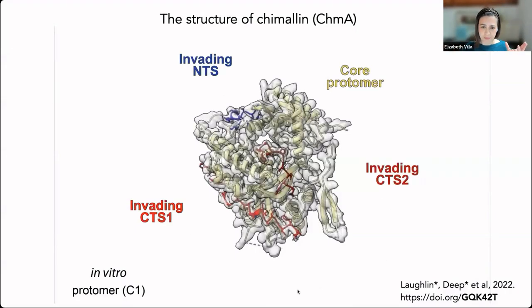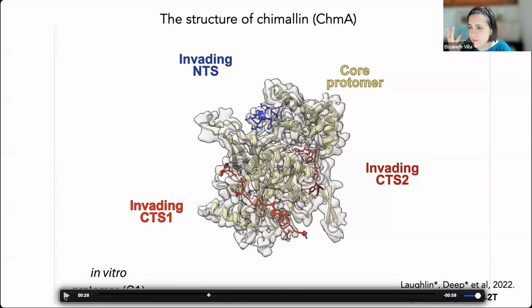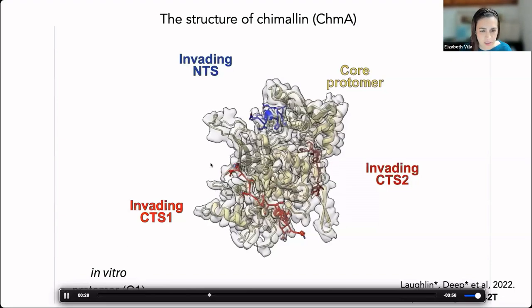One from a phage that infects E. coli and one from a phage that infects Pseudomonas. And his highest resolution structure, I think it was about 3.1 angstroms. And I have to tell you that the only homology that we had found to this thing in terms of structure was actually a tRNA acetylase, which of course makes no sense to build things from a toxin antitoxin system.